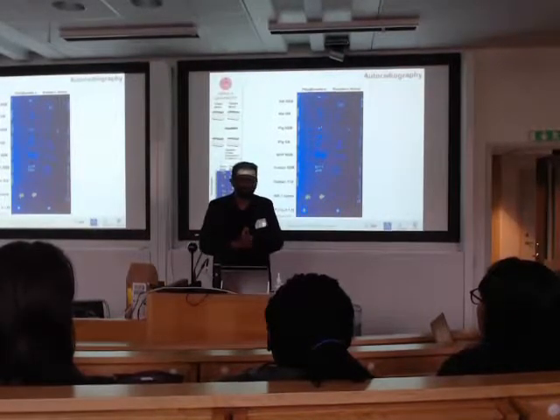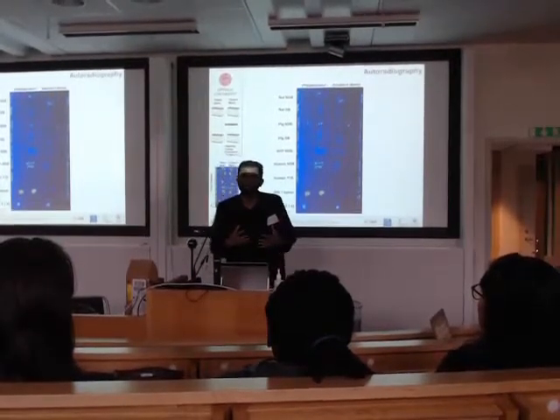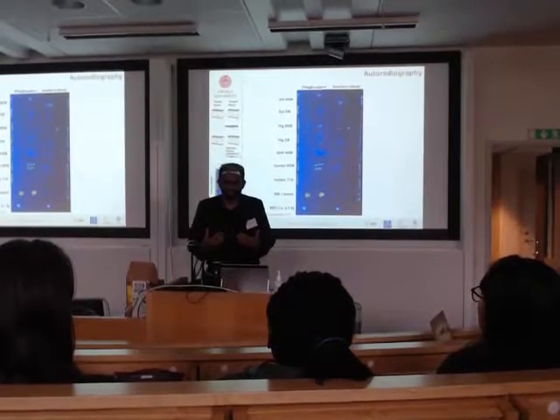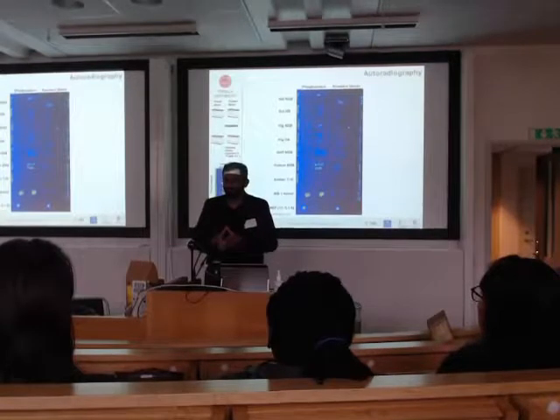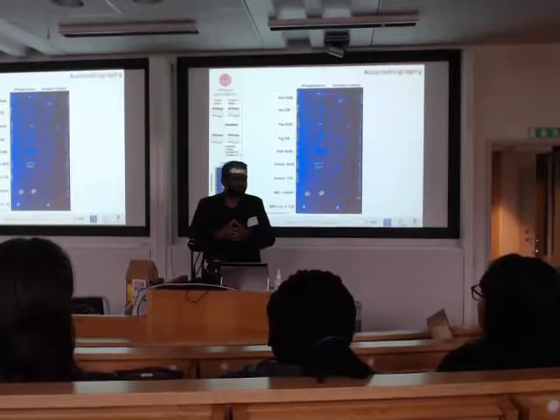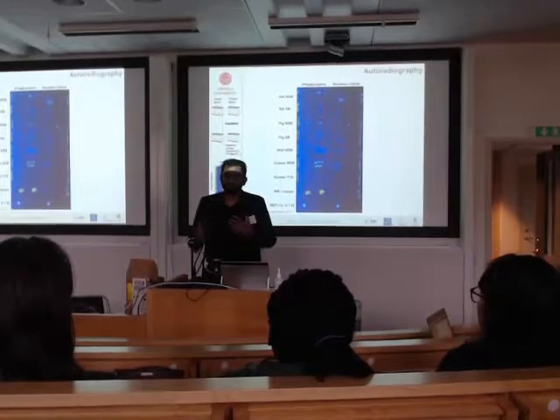That's the basic step. Then we take the next step towards tissue samples. We have a small biobank with tissue samples from different animal species. In this case, we are interested in the pancreas. Here you can see we tested pancreatic samples from different species. But this is primitive. Right now, these are in vitro studies, where you subject the tracer to just buffer, so there is no competition. It's just whether it binds or doesn't bind.